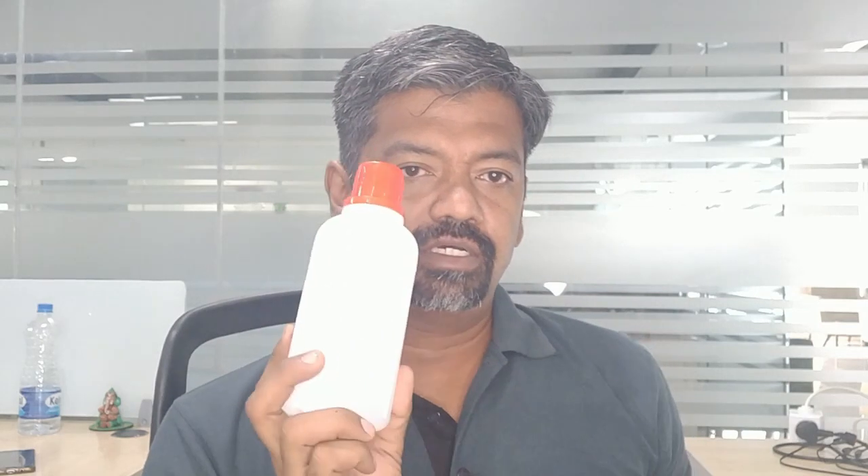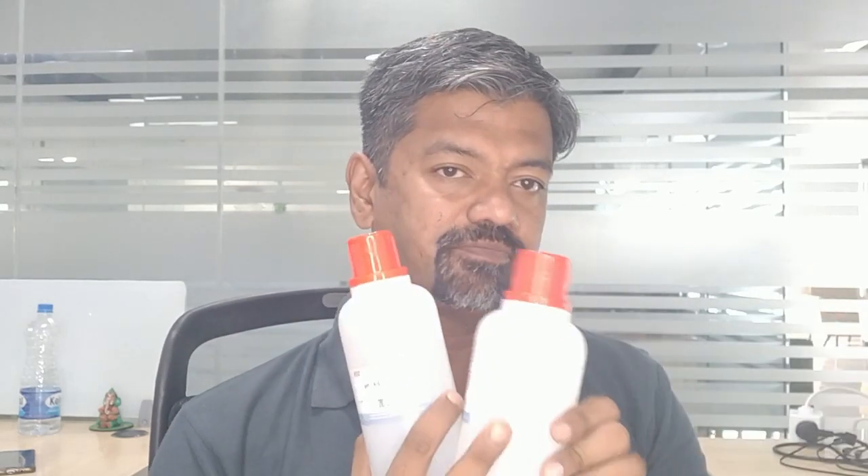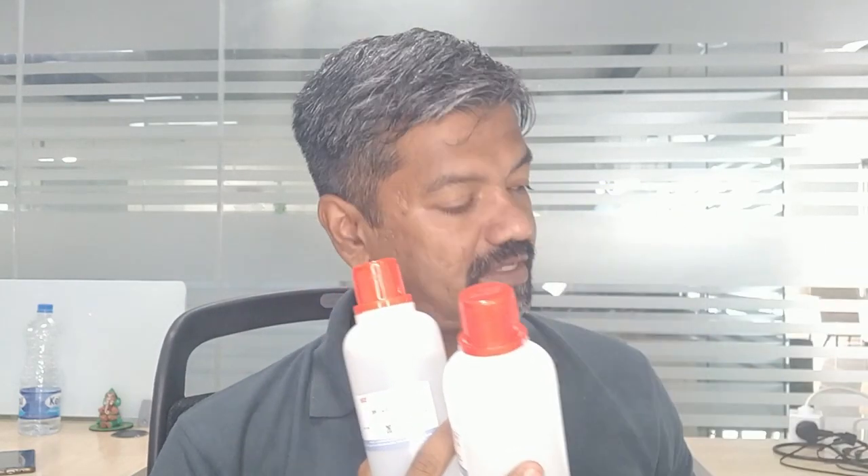To demonstrate various pH values, I have three standard solutions whose pH is already determined — these are called buffer solutions in the chemical world. Buffer solutions are going to be very useful in your hydroponic journey. I have three buffer solutions: 4, 7, and 10. I'm also going to tell you why you need at least two of them to have an accurate pH measurement with your pH meter.